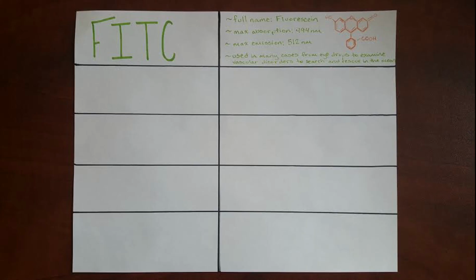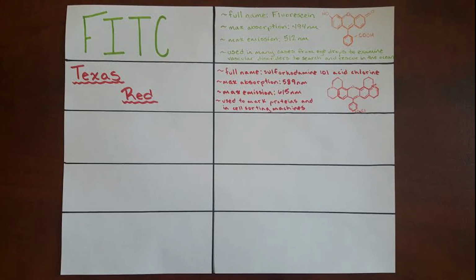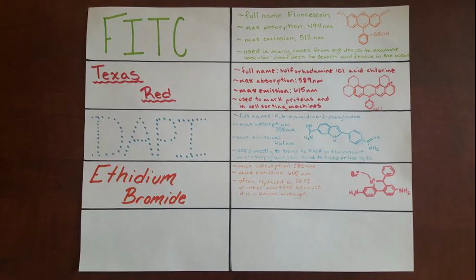Fluorescent microscopy is a way of looking at microscopic particles by looking at the light that they emit, rather than through the traditional way of shining light onto them. Samples are stained with different types of fluorophores, which are fluorescent compounds. The fluorophore used depends on what the scientist is examining.